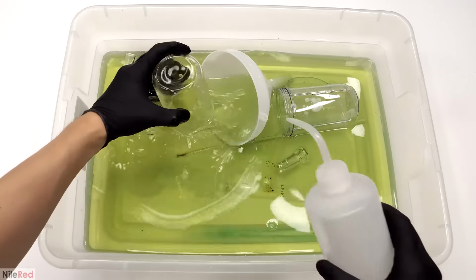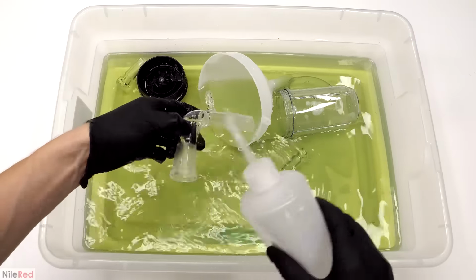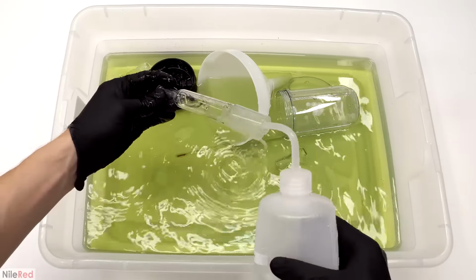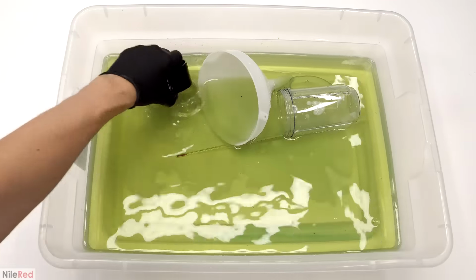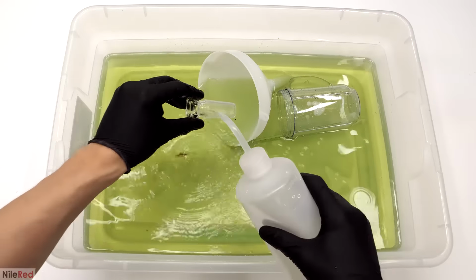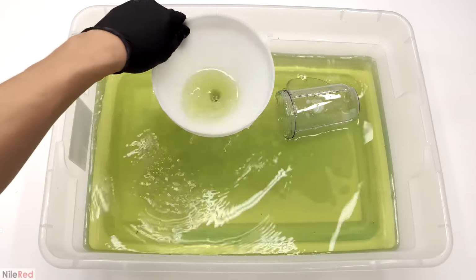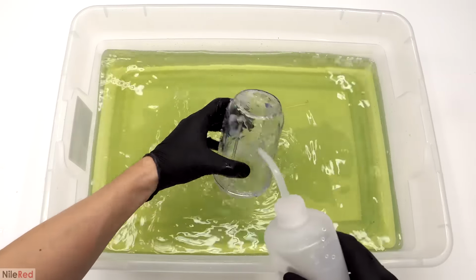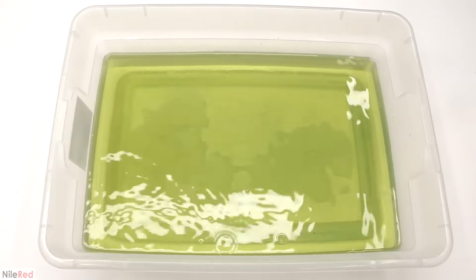As I said before, the chromium was now in its 3+ state, but it still wasn't something that I could just pour down the drain. So, I was actually kind of making more waste here that I would eventually have to deal with. However, as long as I was working with the chromyl chloride, I had to keep a bath like this around. This bath was of course useful for washing things, but it was also for safety purposes in case I had to neutralize a whole bunch of the chromyl chloride. With that being said though, this meant that this bath was something that I'd have to have for the entire project, and I would only be able to deal with it at the very end.